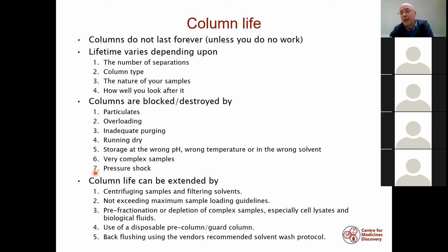But you can make columns last a long time, and you can do this by centrifuging your samples to remove particulates and filtering any solvents. Obviously, don't exceed the maximum sample loading guidelines. You can find these in the manufacturer's notes or online. You can also pre-fractionate your sample, or you can deplete complex samples.